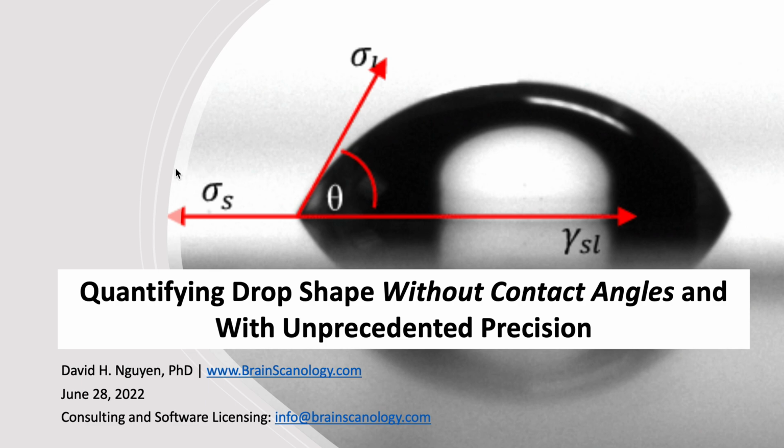In this presentation, we're going to talk about measuring shapes of droplets without using contact angles and how the LCPC transform provides so much more depth of information than contact angles. So contact angles are typically measured at the interface of the liquid droplet and the physical surface. And it is this angle right here, one on each side of the droplet.